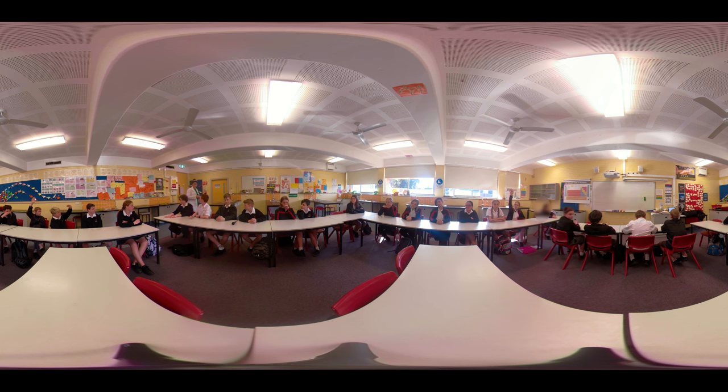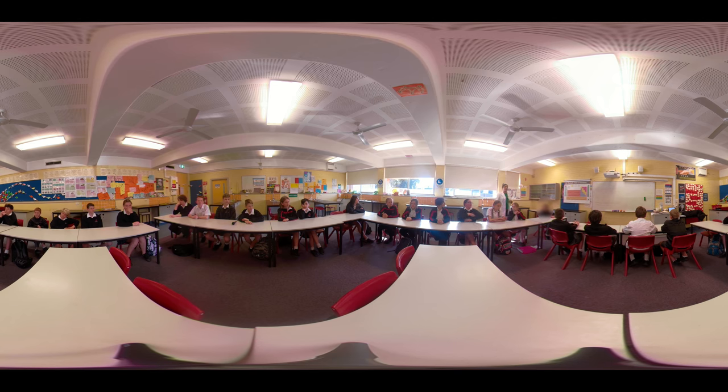Eye damage from the light. Yep, eye damage from light — magnesium gives off a very bright light, so looking directly at it can cause temporary eye loss. Chloe? Wearing enclosed shoes, so we don't get any droppings on our feet and burn ourselves. Walter? Make sure the gas tap is turned off when you're done, so no gas molecules are released into the air and make our room harmful.